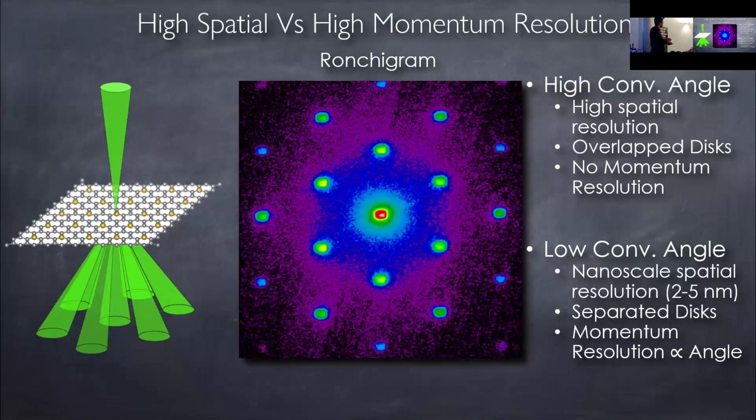Heisenberg's uncertainty principle in the microscope, right? So what I'm going to do is experiments like that with a small convergence angle, because then the Brillouin zone is perfectly there. So you have the Bragg spots, and my Brillouin zone should be somewhere over here in the middle, right?